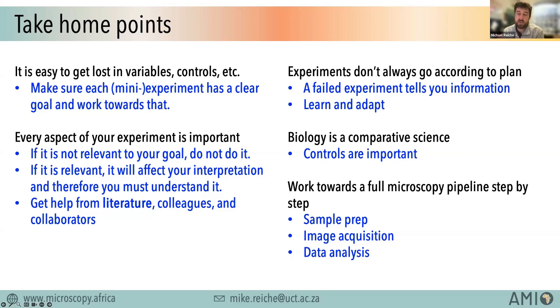And then the second point, yes, you can ask the literature, but if you have a core facility available and if you're fortunate enough, ask them. They're sources of information and experience. Ask people that have prior expertise in microscopy, and they'll be able to either answer your question or point you in the right direction at the very least.